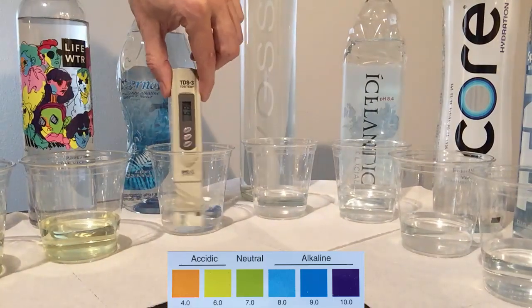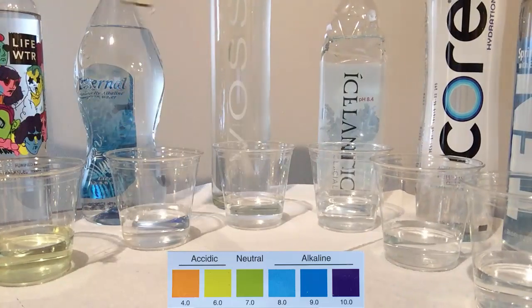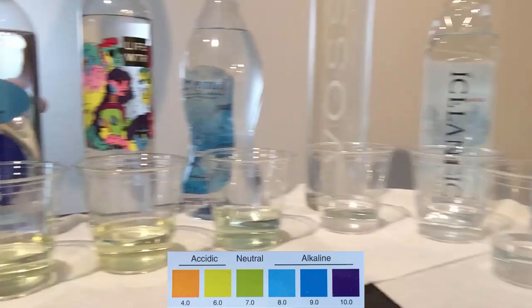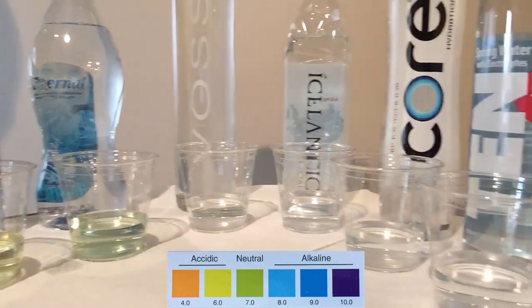Eternal Water comes from the Smoky Mountains in Tennessee, and the bottle claims natural alkalinity at about 8 pH. With a TDS of 69, the pH of this water is somewhat bluish — so possibly 8, maybe 7.5.